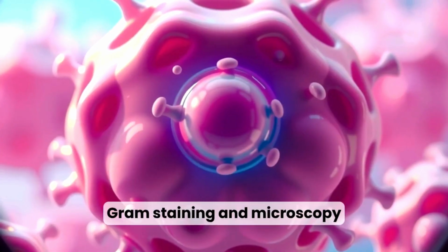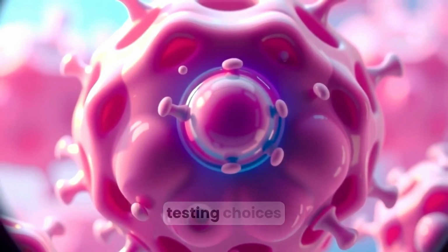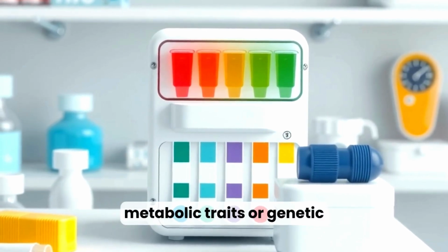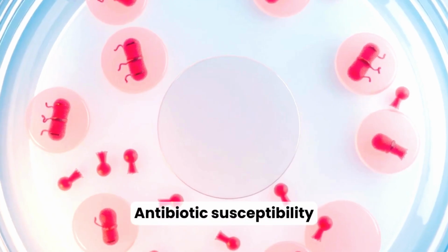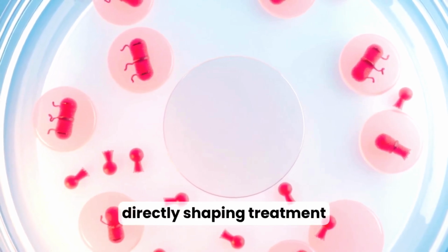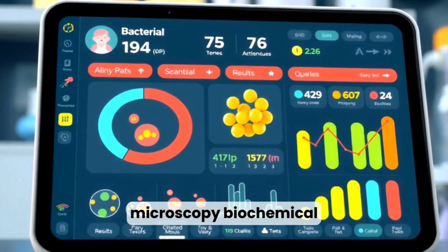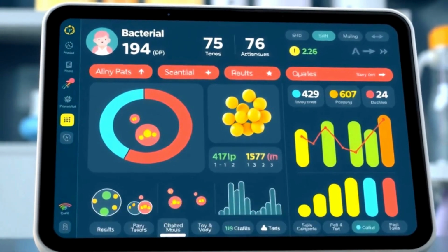Gram staining and microscopy give rapid, essential clues about cell shape and wall properties, guiding further testing choices. Biochemical tests and antigen or molecular assays identify metabolic traits or genetic markers that define species and strains. Antibiotic susceptibility testing determines which drugs inhibit the isolated bacteria, directly shaping treatment recommendations. Interpreting lab results combines colony appearance, microscopy, biochemical, molecular, and susceptibility data to reach a confident ID.